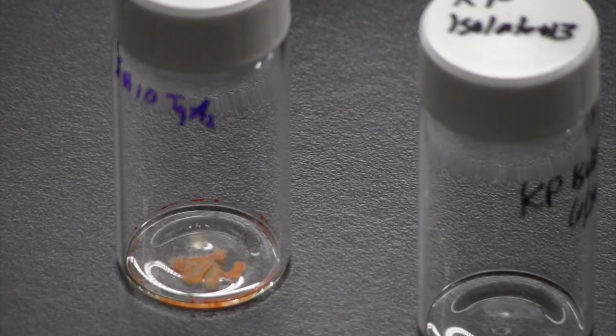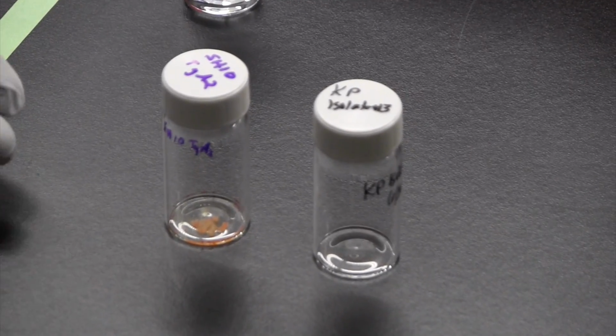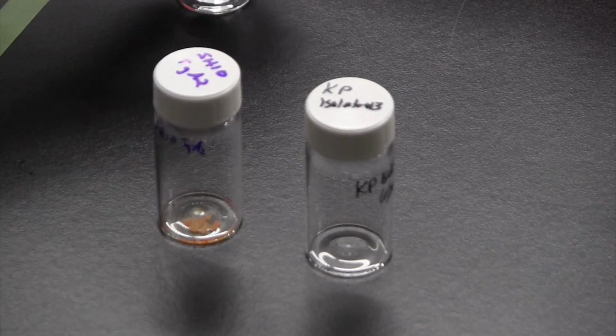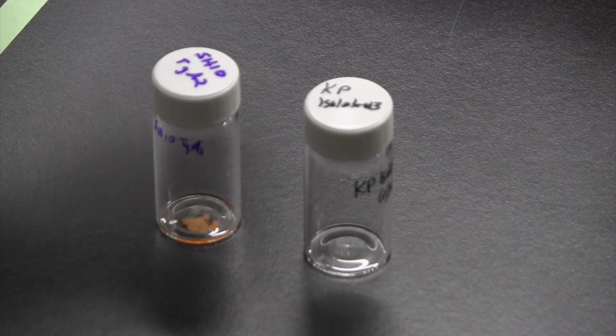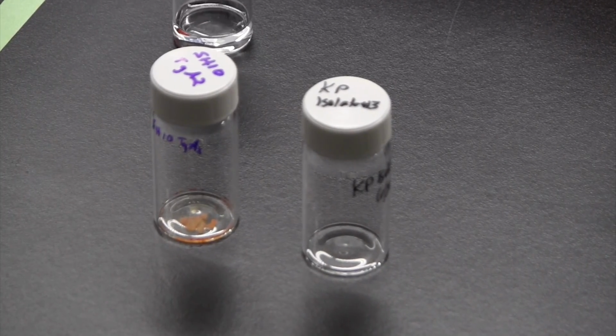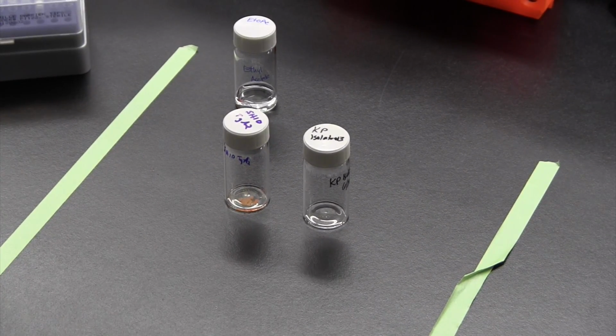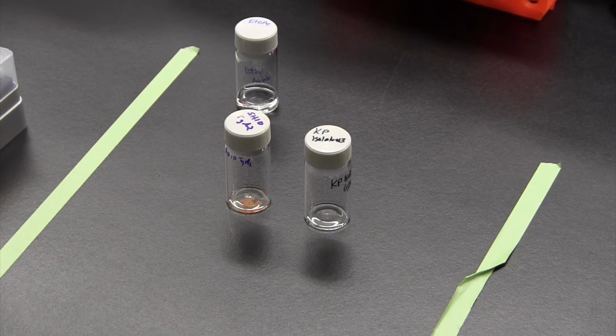So the next step is to resuspend this chemical extract. We're going to resuspend the chemical extract into just ethyl acetate again, and then we're going to use that resuspension, hopefully nice and concentrated, and dot that onto a plate and test that against our tester strains, which we'll show you in another video. So for right now, we're just going to show you how you're going to resuspend this.